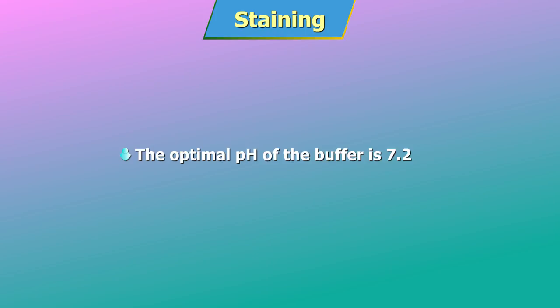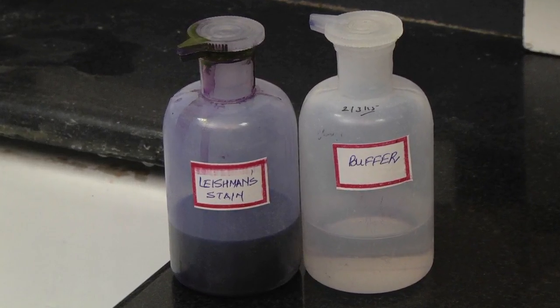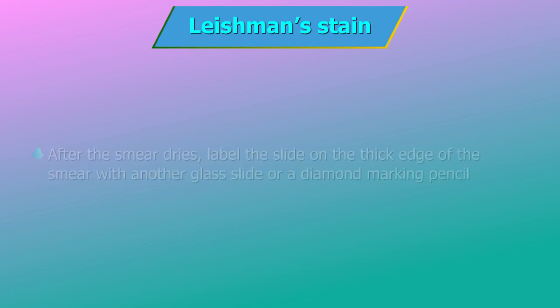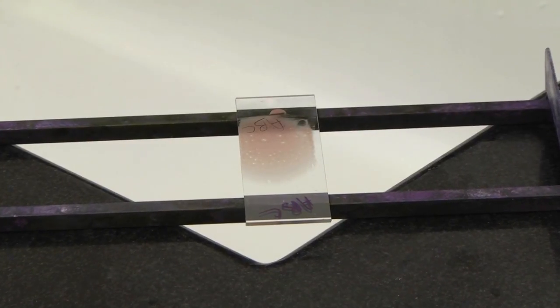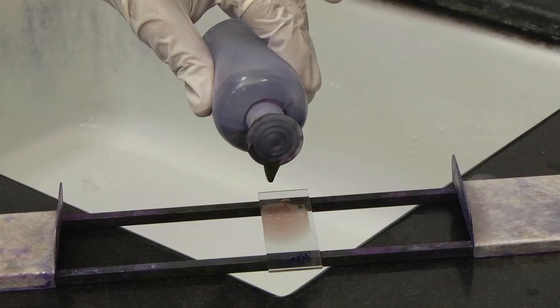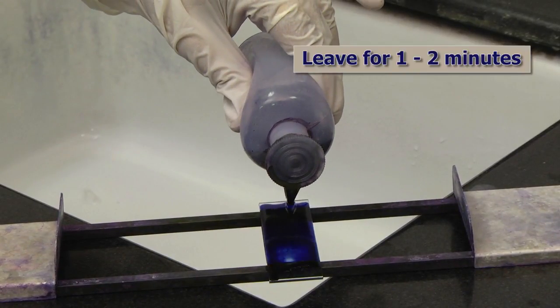The optimal pH of the buffer is 7.2. Here, staining by Leishman stain will be demonstrated. After the smear dries, label the slide on the thick edge of the smear with another glass slide or a diamond marking pencil, as the earlier markings can be washed away while staining. Next, place the dried slide on the staining rack and add 7–8 drops of the stain. Leave for about 1–2 minutes.